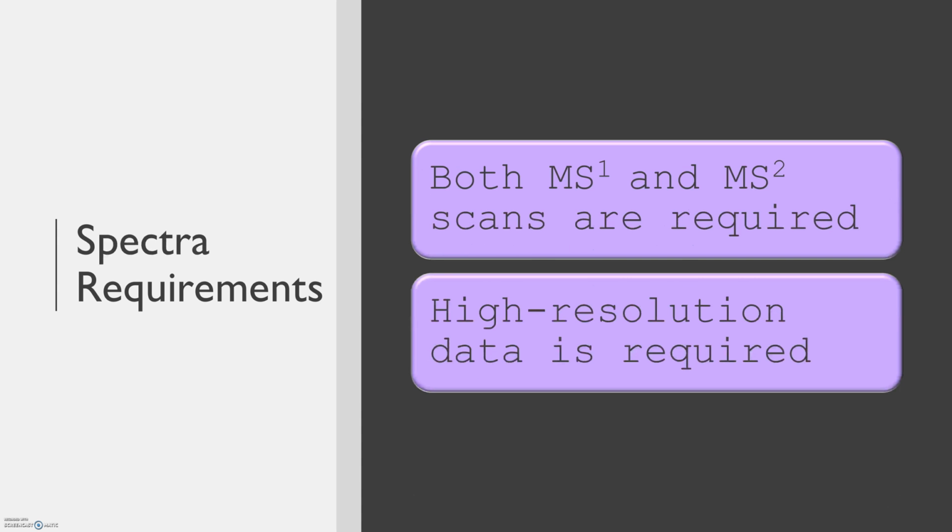Next, let's discuss spectra requirements. You will need to have both MS1 and MS2 scans, and your data must be high resolution.